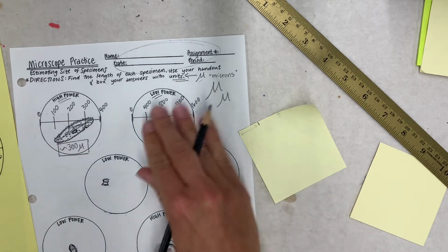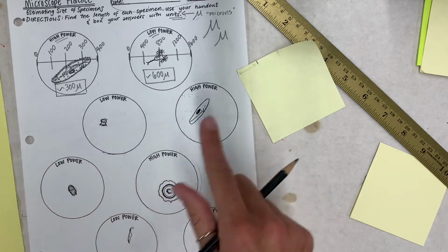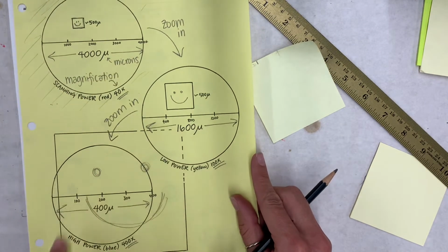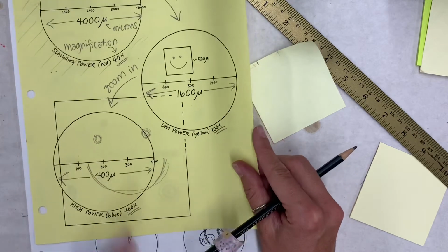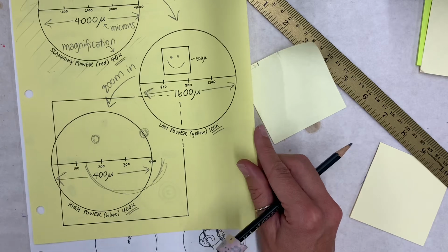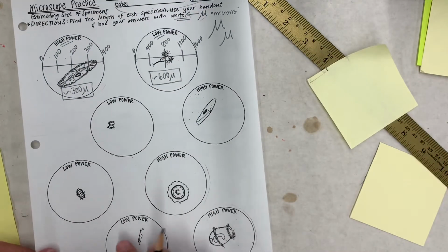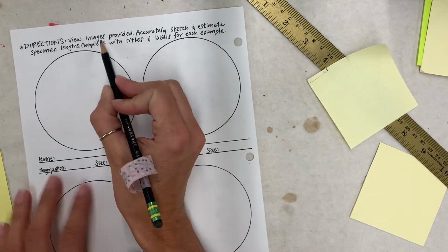Okay, so you're going to repeat this procedure for the rest of the specimens here. Start with your straight line, use your yellow handout, take a look at those numbers that you need to use. You might be using scanning, low, or high power. The distances across each of these fields of view are different. When you're done with the front side, you'll be ready to continue on to the back of the page where you will be provided with images.